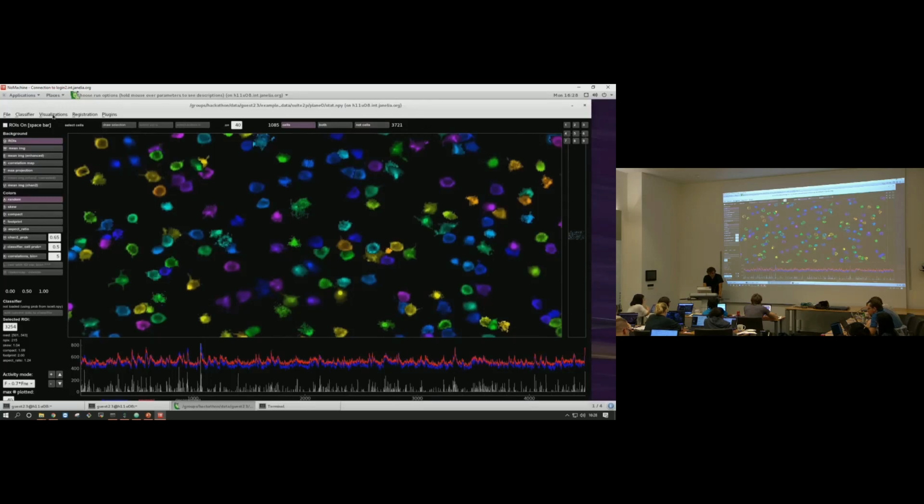Okay, so now let me tell you what happened. The only thing that you've changed when you right-click on ROIs and move them left, right, is you changed its label from 0 to 1 in this file on disk called iscell.npy. It's literally just a long vector of zeros and ones. It's actually two vectors. One is 0s and 1s.